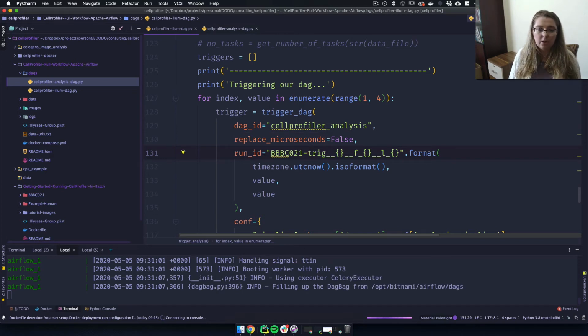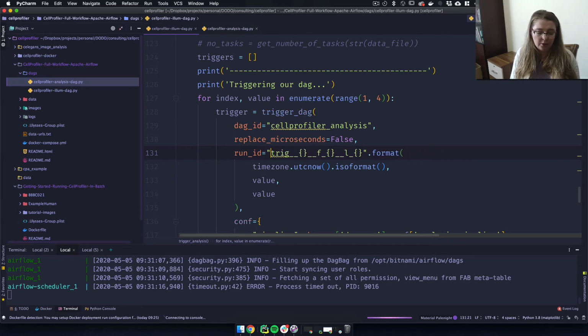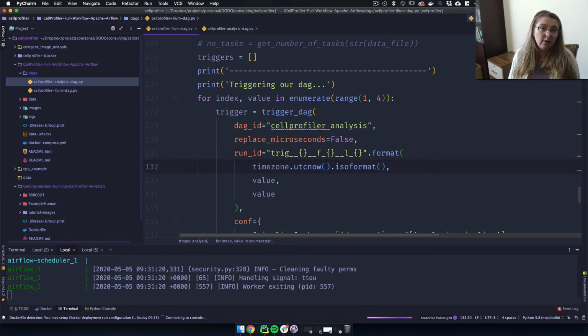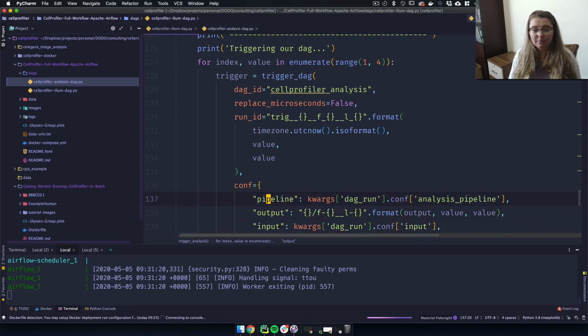If I was really sitting down and properly doing this, I would make sure that each DAG is named for its analysis type. I like to make sure that things have a very human readable, functional name, not just a computer name. I care less about the integer types and more about what I'm actually doing with things.